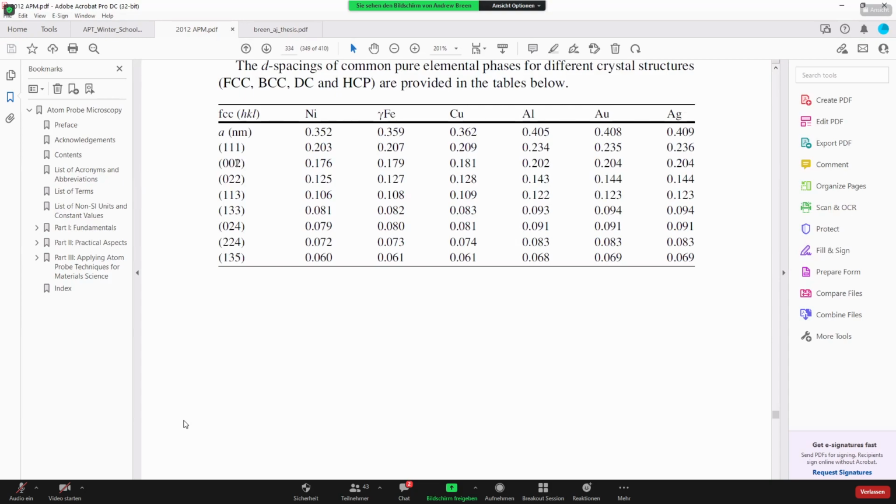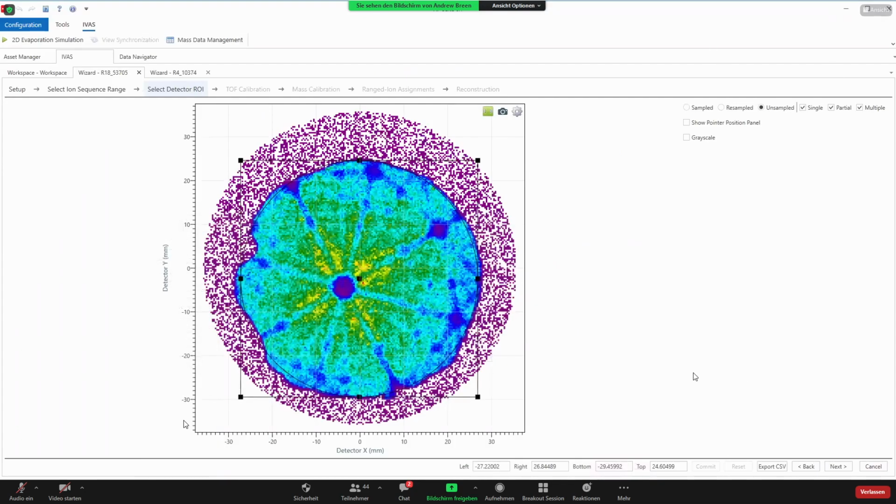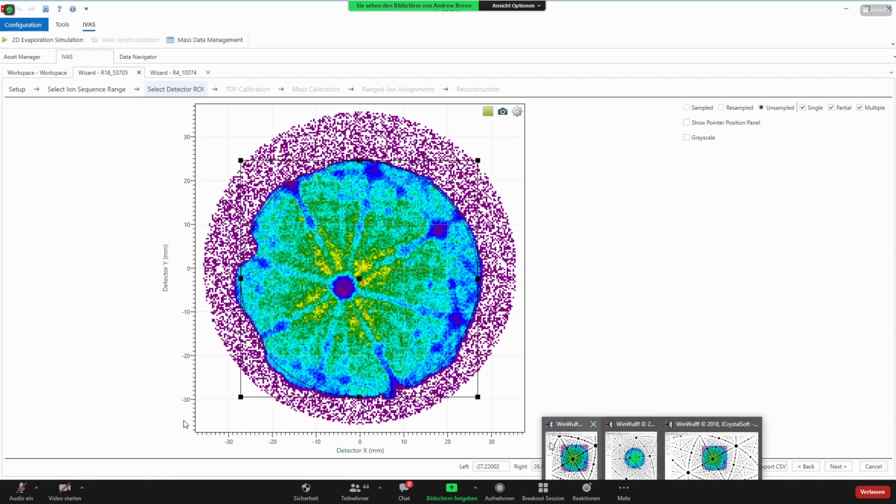So you see how 002 is listed here, 024 is listed, 224, so not 114, not 012, if that's making sense. You can look to the back of the textbook there, or there are other ways in which you can do it, but it is important that you do that. So anyway, we know what the poles are now.